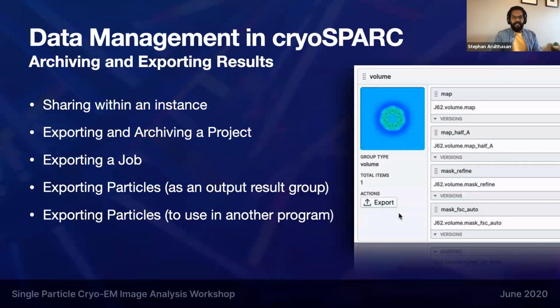Okay, now I'm going to go over some data management aspects in CryoSPARC. CryoSPARC has several critical tools and features for dealing with cleaning up, archiving, transferring, exporting, and importing projects. We've also created tools for exporting and importing individual jobs and individual results of various types like particles, exposures, volumes, and more. So all these tools allow you to do things like sharing.